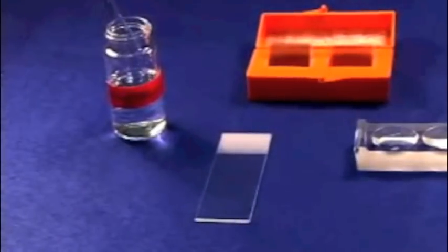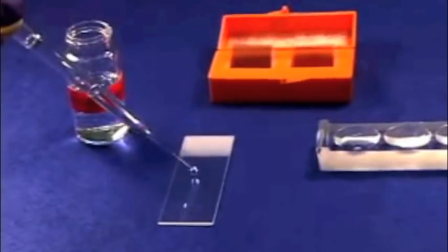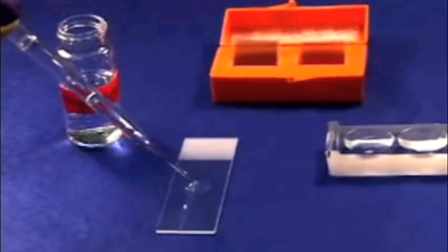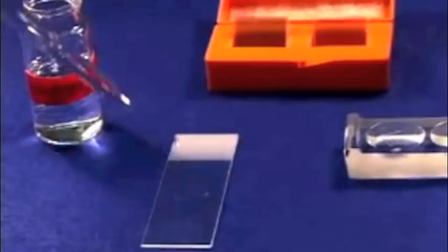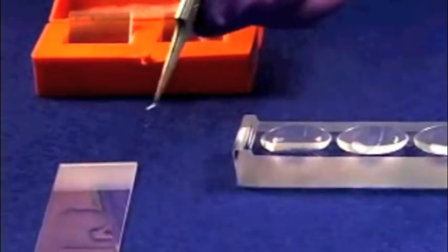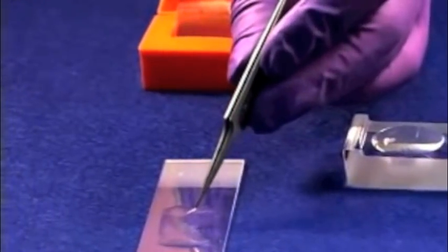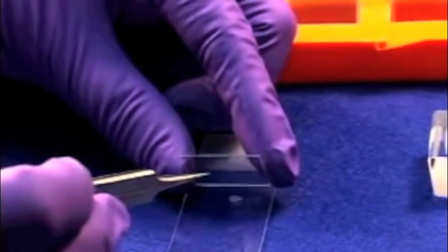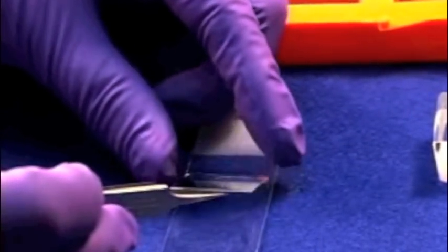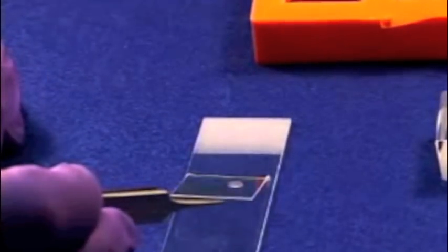Pull some mounting medium into a Pasteur pipette and place a small drop on the slide. Next, carefully pick up the brains by holding the connectives and place it in the mounting medium on the slide. Now lower one side of the cover slip into the edge of the mounting medium and very gently and slowly lower it over the brain to minimize the bubbles in the solution.